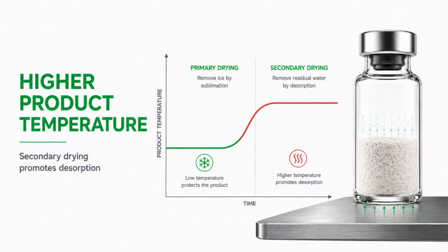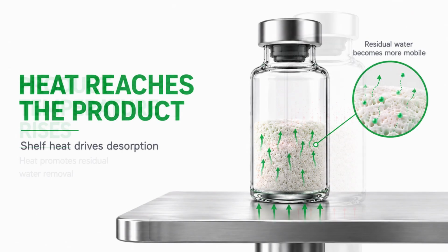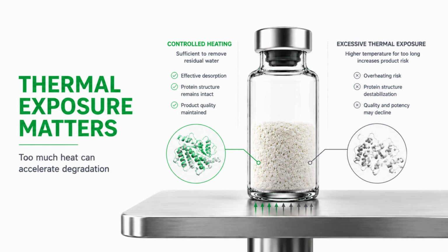Desorption is promoted by increasing product temperature. Heat is transferred from the controlled shelf through the vial and into the dried product. But higher temperature does not automatically mean better drying. More thermal energy can accelerate moisture removal, while excessive temperature or exposure can increase product stress. The process therefore has to balance effective desorption with product stability.